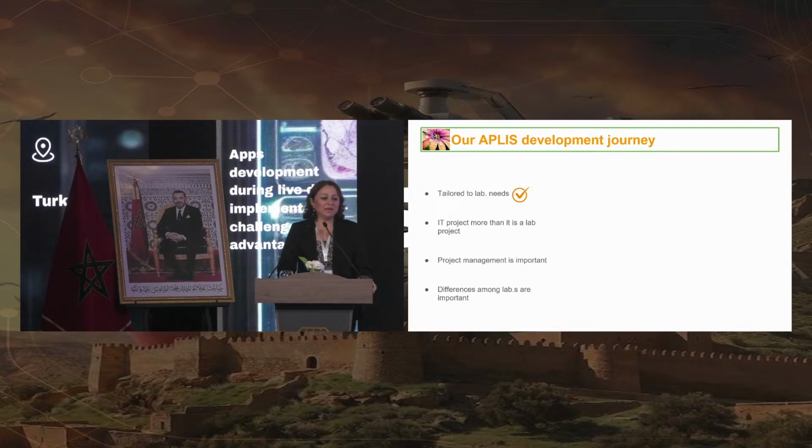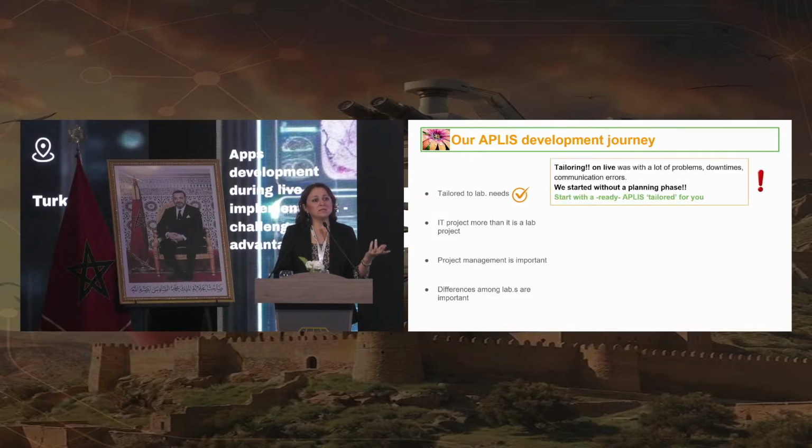So, what we had in our APLIS development journey: the ideal APLIS is defined as tailored to lab needs. Yes, it was an advantage, but our disadvantage was that we started without a planning phase because of the directory things, financial problems, and I insisted on APLIS, and they said, you can use this because it is cheap now, and the APLIS was not completed.